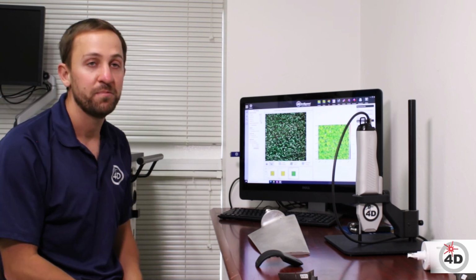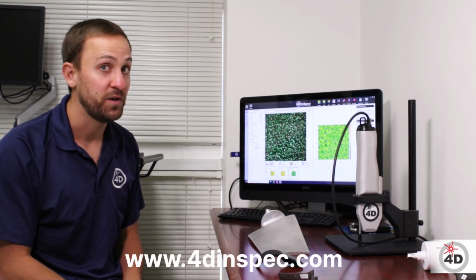So those are the plot options for the 4D InSpec software. Please contact us with any questions, and thank you very much.